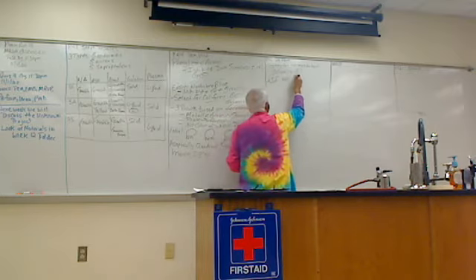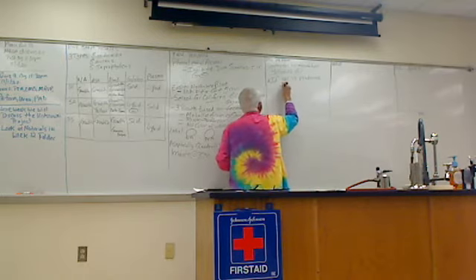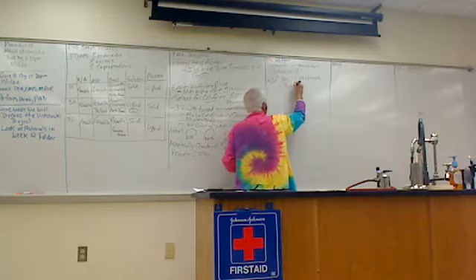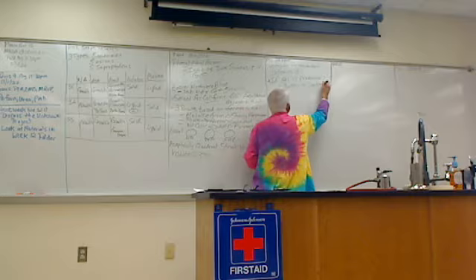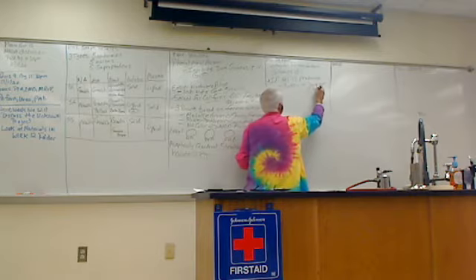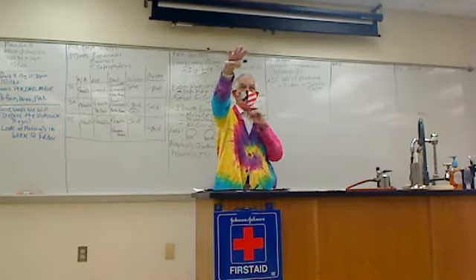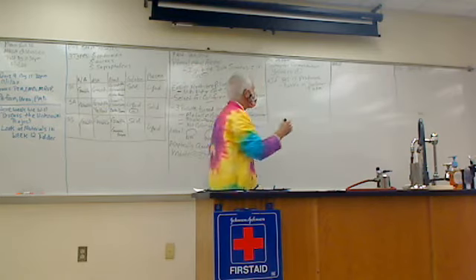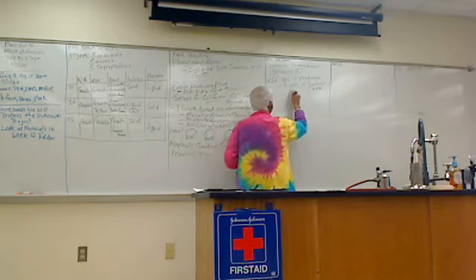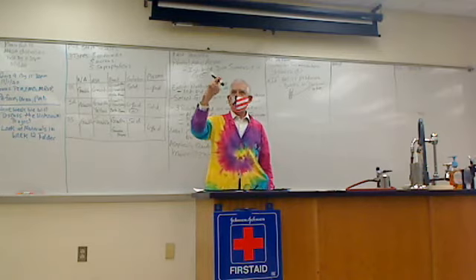If gas is produced, you will have a bubble in the Durham tube. So this is really cool. Again, this side of the room over here is going to set up 3 sugar tubes for this. When you look inside, guys, really cool. There's another tiny tube on the inside to collect gas.